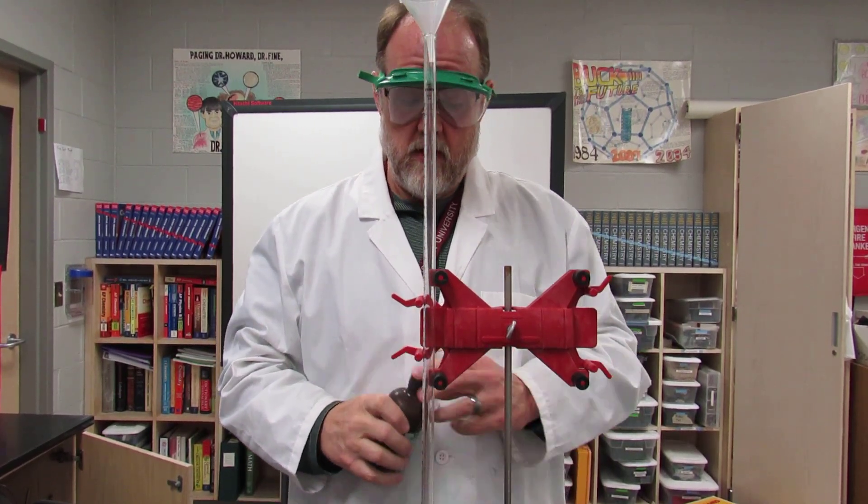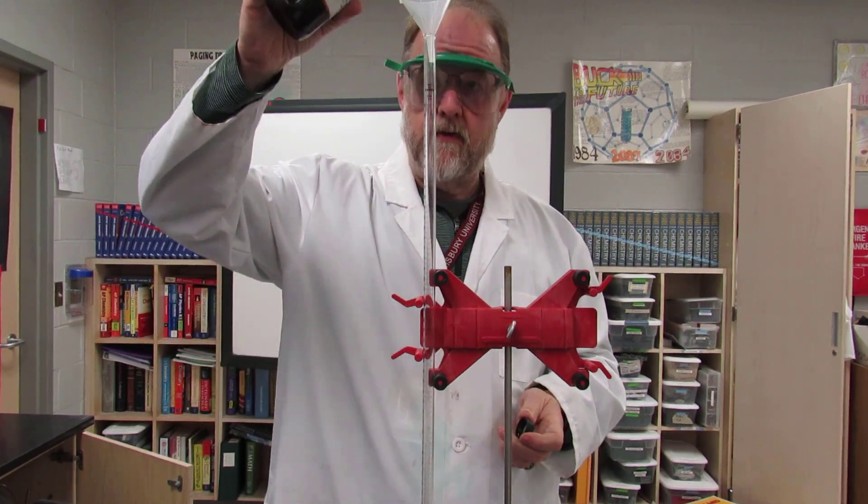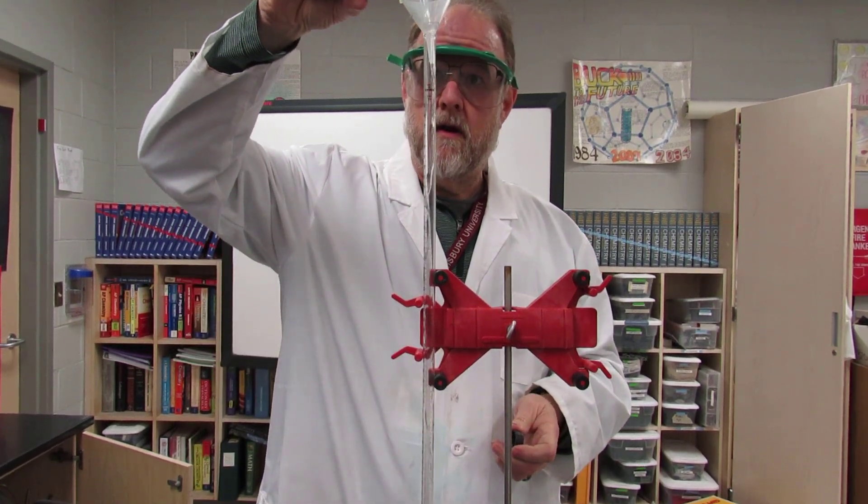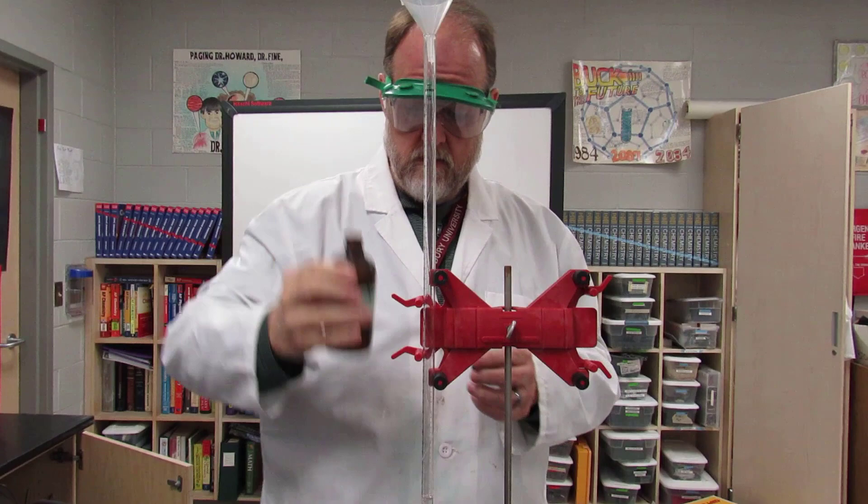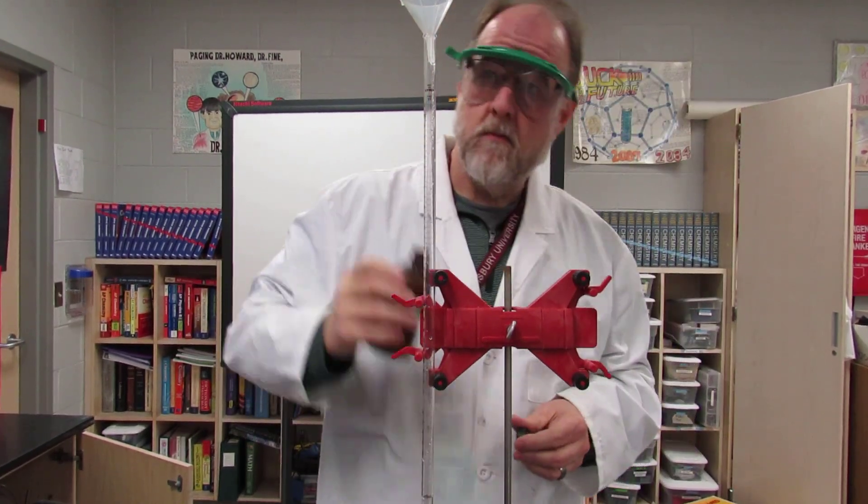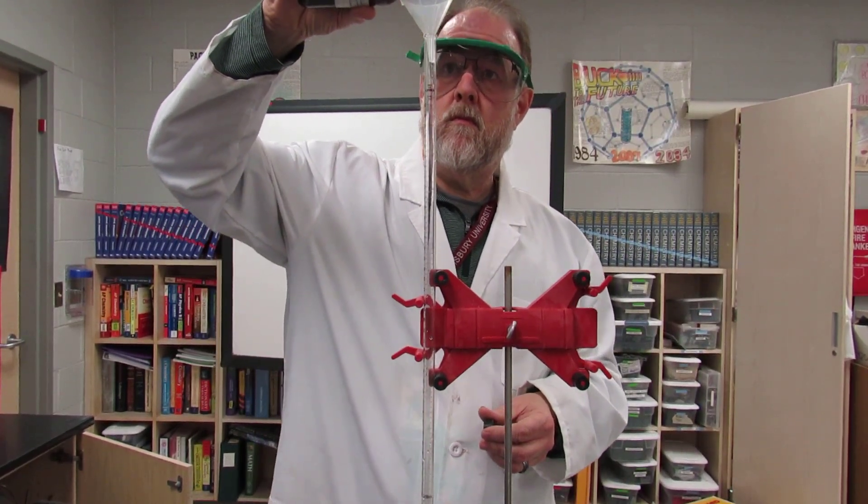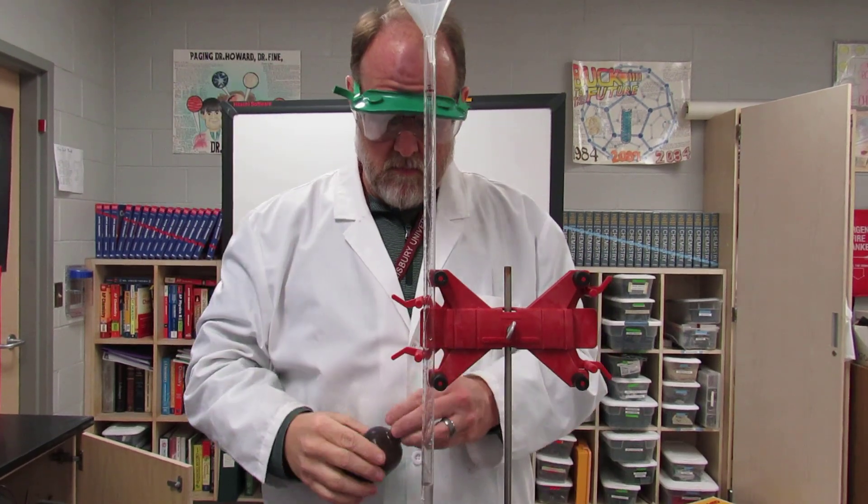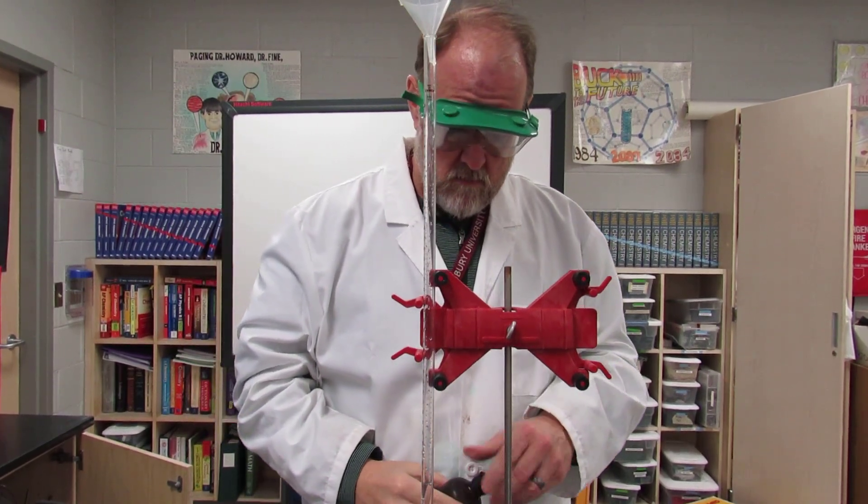You're going to pour some in and add between 10 and 15 mL. Use the graduations on the eudiometer to do that. You do not need to use a graduated cylinder to determine that. I think I need a little more, so add between 10 and 15 mL and you're good.